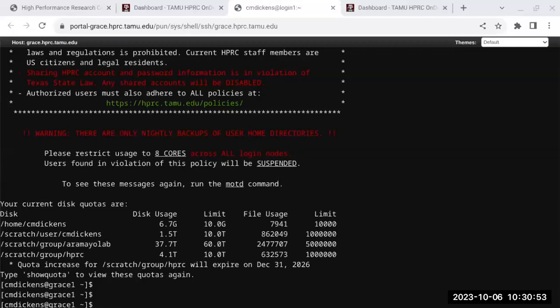All right, tool suite. SMRT Link is provided by PacBio. This is a list of some. I'm sure there's more now since I've made this slide, and maybe some of these are different, but you can see some of the useful ones in here. There's Minimap2, there's pbalign, BLASR, that's a useful one.